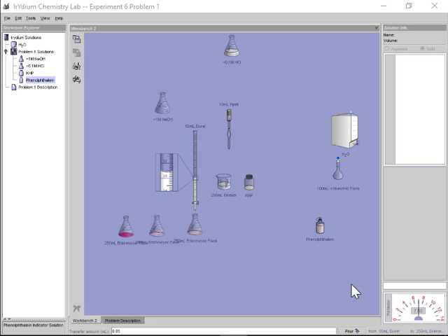We saw towards the end of last lesson how we can actually convert that over to find the concentration of NaOH. Here's back to our virtual simulation. I'm just going to finish off with part two of this part. I'm going to walk you through another set of titrations.